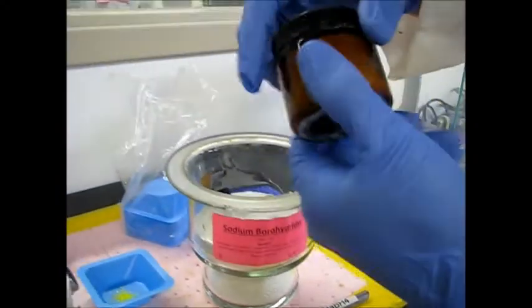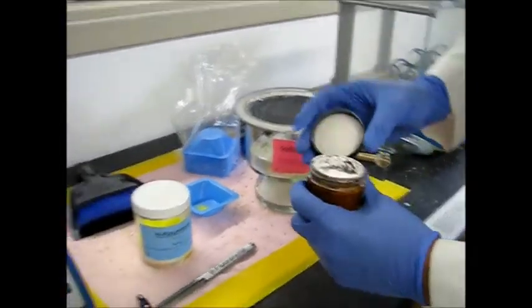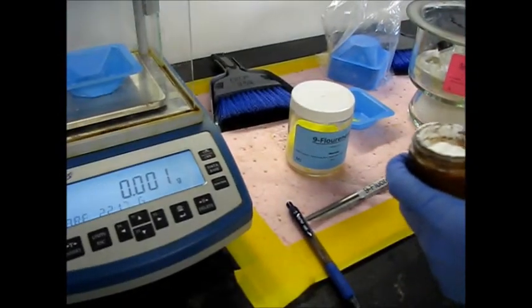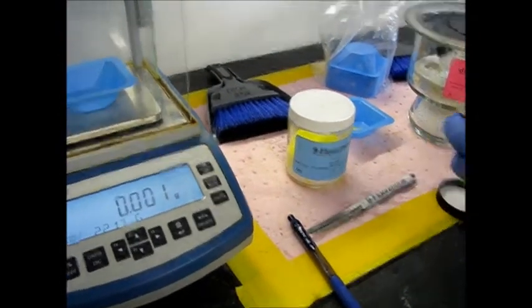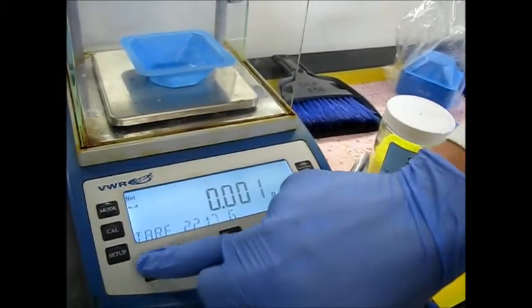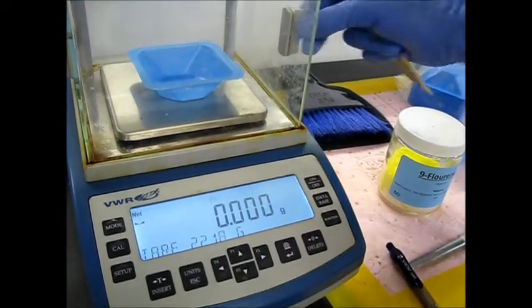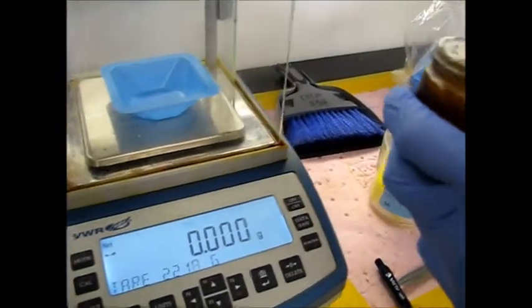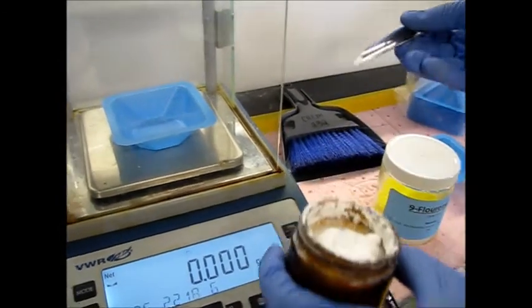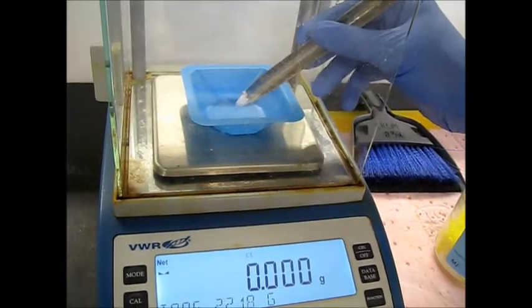So now we're going to grab our sodium borohydride and get 50 milligrams, 0.05 grams. We did have a little bit of fluctuation, so we're just going to re-tare. Cool. It shouldn't be much at all. Just going to grab a little bit. Try to tap it out.